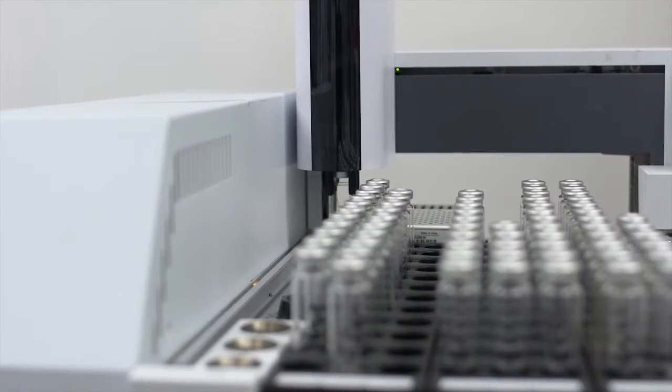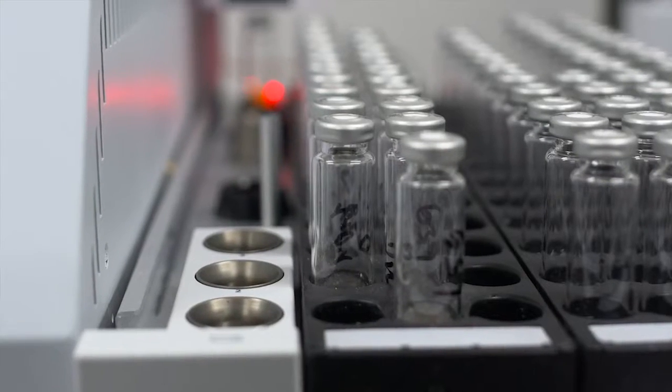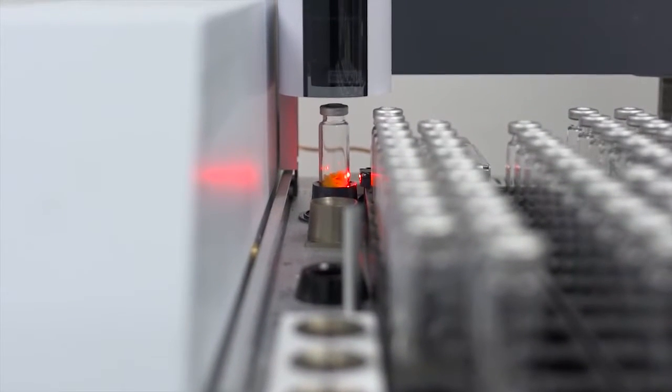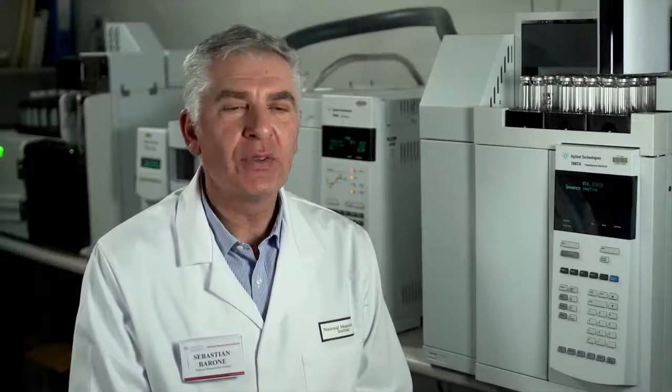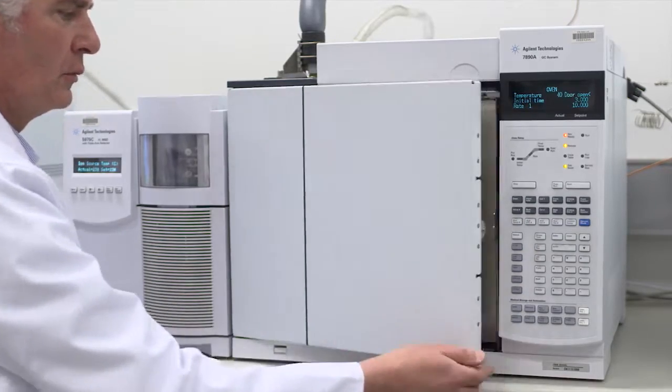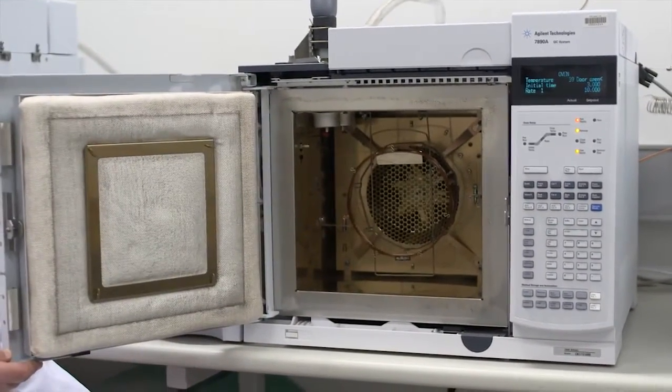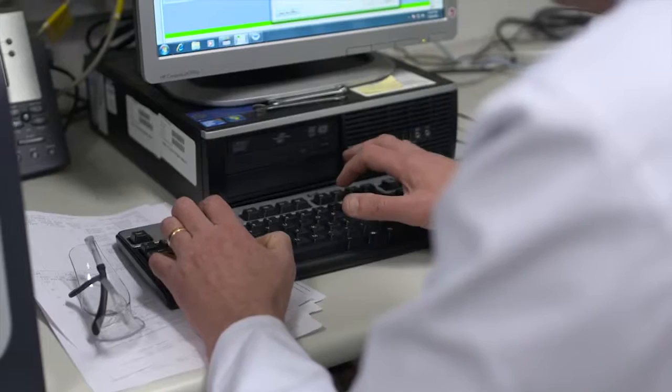The GC has a customized microfluidics configuration to allow the measurement of VOCs from either sampler. These VOCs may be targeted for food compositional, metabolomic or chemical testing or screened to identify unknown chemicals for investigational purposes to ensure food safety.